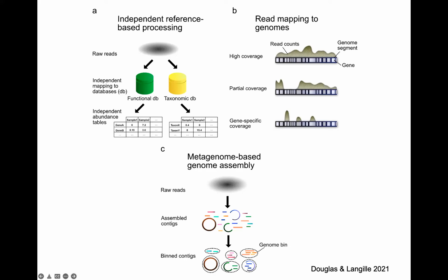And then I put this up, you don't see this as much maybe, but it was definitely popular in the past and is still really good: this idea of mapping reads to genomes to look at coverage of certain genomes in a reference database. This used to be called fragment recruitment. It was pretty popular. And sometimes what you're looking for is how good a coverage you're getting. We actually do this a little bit with our blood microbiome, where we're really trying to show, you can imagine if an organism's there and you really want to show it's there, we should have pretty good coverage, not just one spot in the genome.